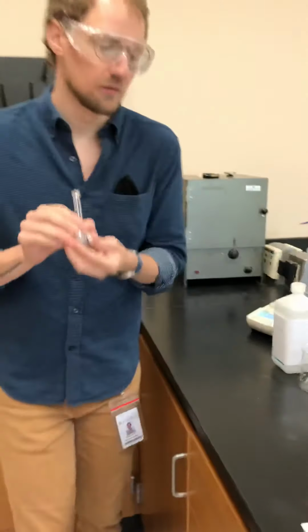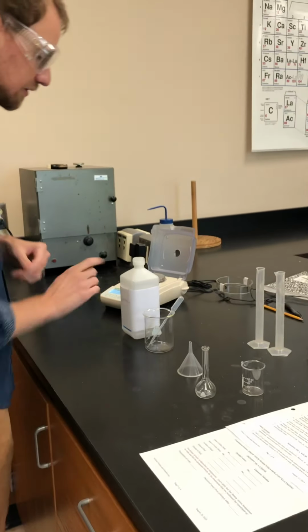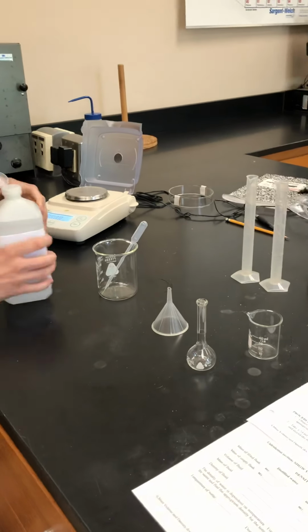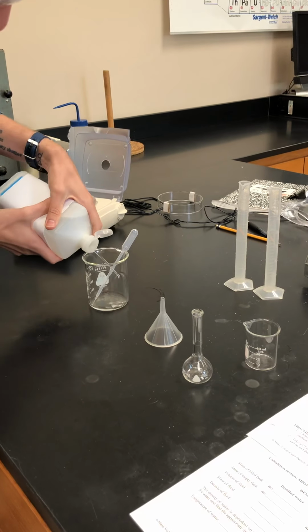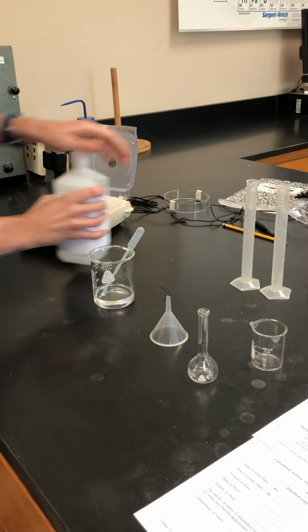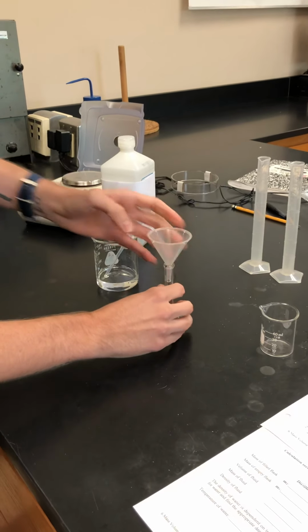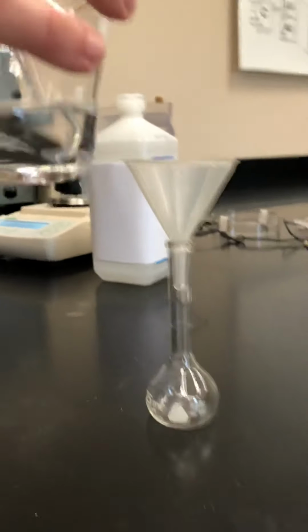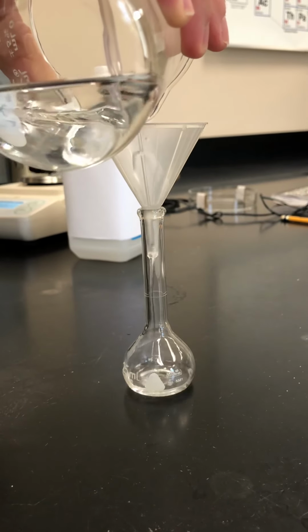All right, so now we've got the mass of our empty volumetric flask. Now we're going to fill it up with our unknown solution. I'm just going to pour a little bit into this beaker because I can't really pour it directly from this large bottle into our volumetric flask. So I'll get a little bit, try not to get way too much, so I'm not having to waste too much. I'm going to use a funnel to pour it into my flask, just because it's a little difficult to pour from a large beaker into a small opening inside the flask. And we're going to fill it up to the line, to that mark.